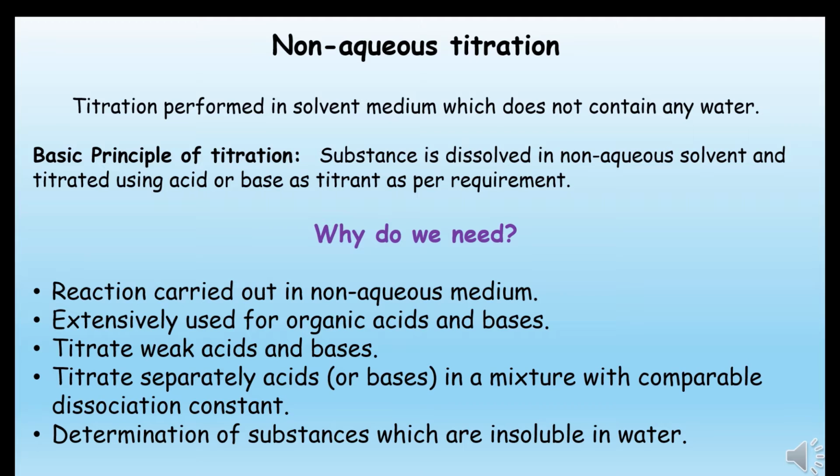So what is the basic principle of this titration? It is quite similar to aqueous titration, that is, the substance is dissolved in a solvent, and the solvent is non-aqueous in nature, and it is titrated using an acid or base, which is required according to the substance dissolved.